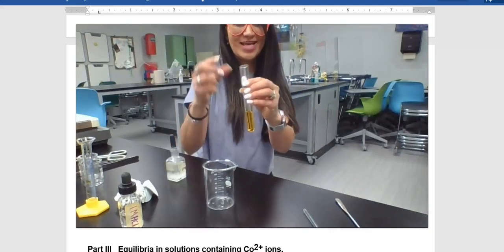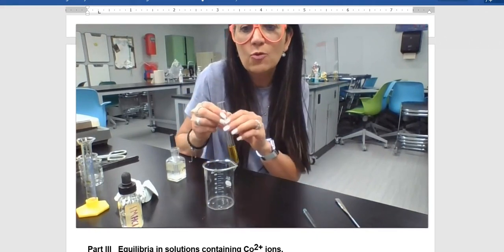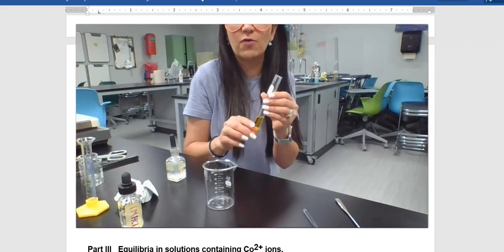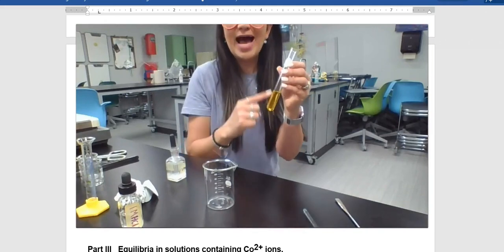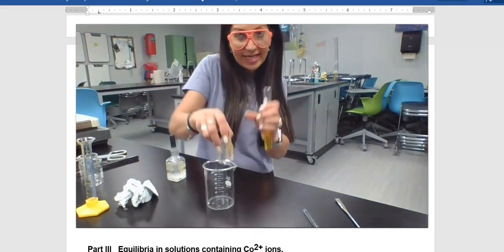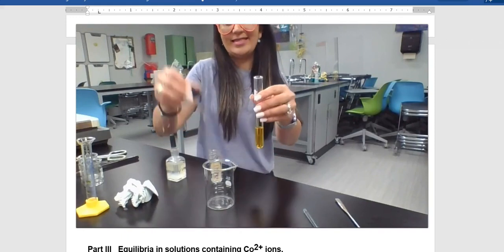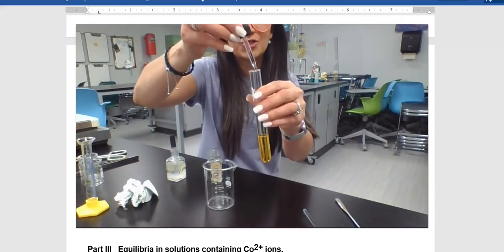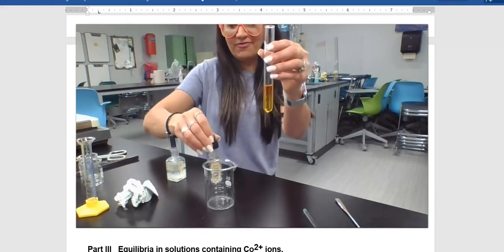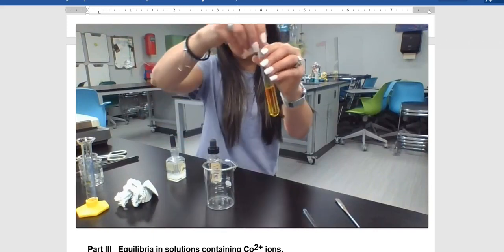Hopefully this helped you figure this out. It says, when you have obtained the chromate ion, the CrO4 2- ion in solution, now convert it back to Cr2O7 2- by selecting the proper reagent. Well, obviously now if I take the HCl and add it back again, I should make the dichromate ion again. Sure enough, it's going back to orange, everybody. There we go, going back to orange.